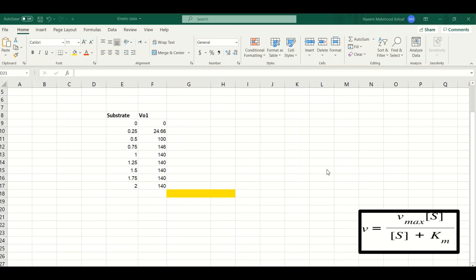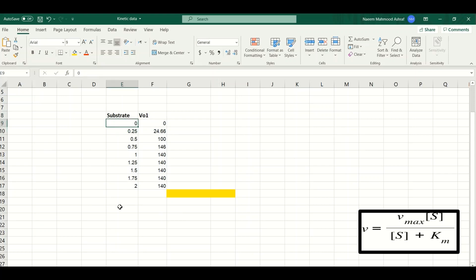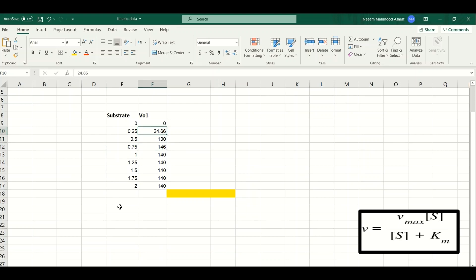To calculate the Vmax and the Km we have two variables: substrate concentration and an experimentally determined initial velocity, or v0. You can see here that the substrate concentration varies from 0 to 0.25, 0.5, 0.75, and so on. At these different concentrations of the substrate we are observing a different velocity of the enzyme, or v0.